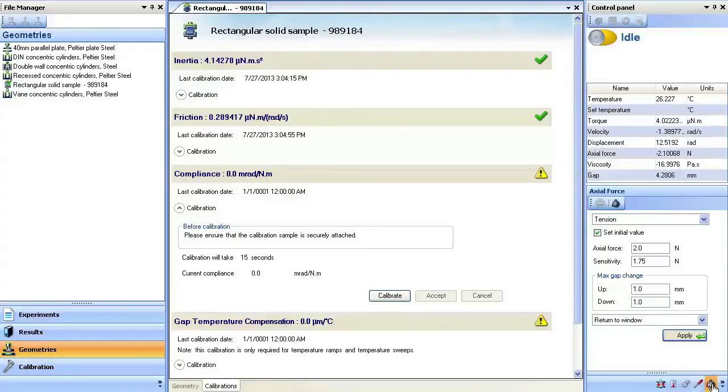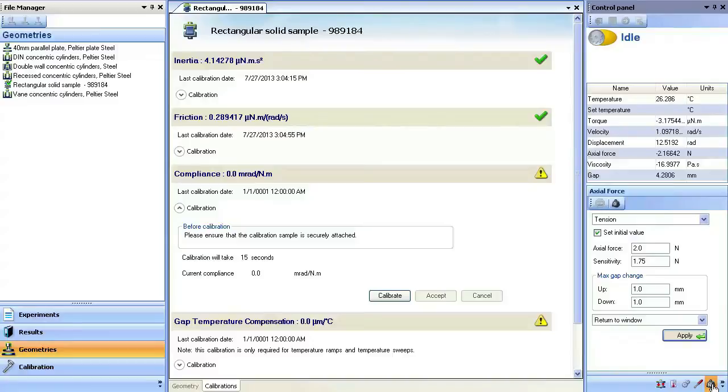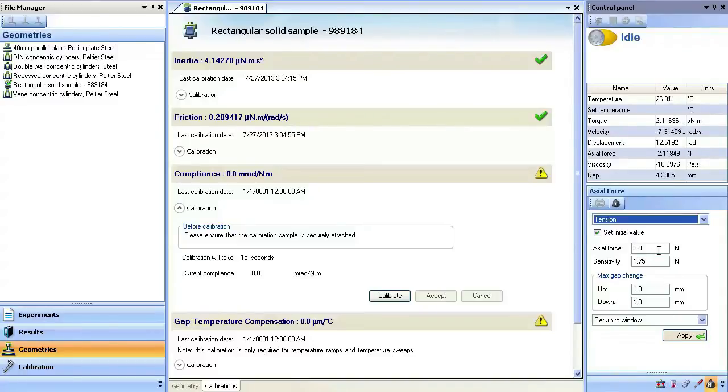From the TRIOS control panel, select the axial force control icon and select tension. Set the axial force to 2N with a sensitivity of 1.75N.